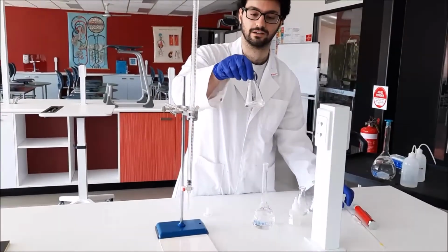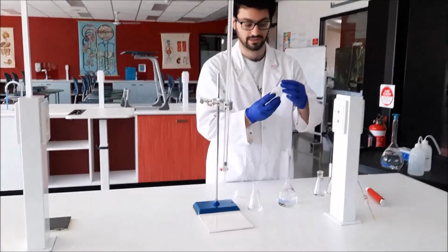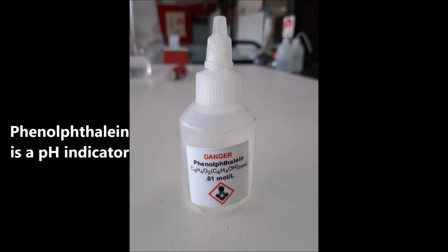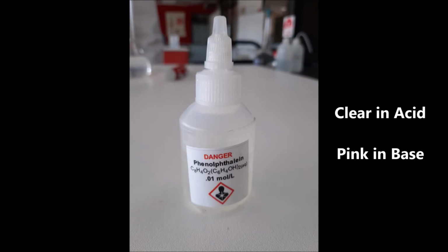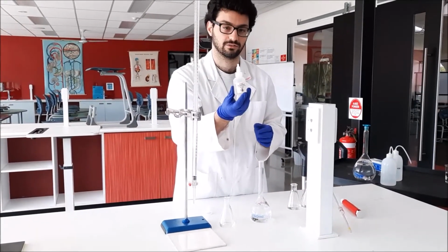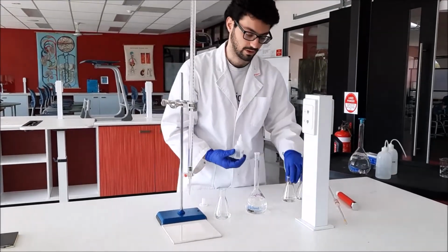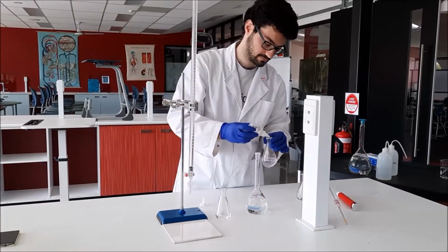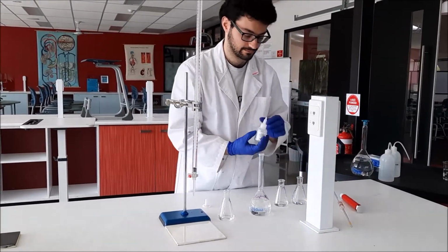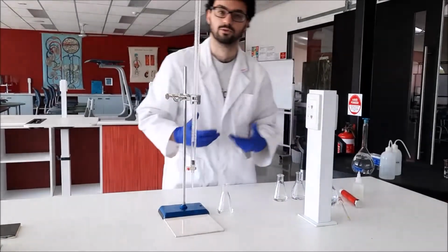So in here we've got our acid, exactly 20 mils, and to that acid we're going to add in our phenolphthalein. So our phenolphthalein is our indicator. So again, we just put in a couple of drops into that one. While I'm at it, I'll do the other ones too. And we're ready to go.